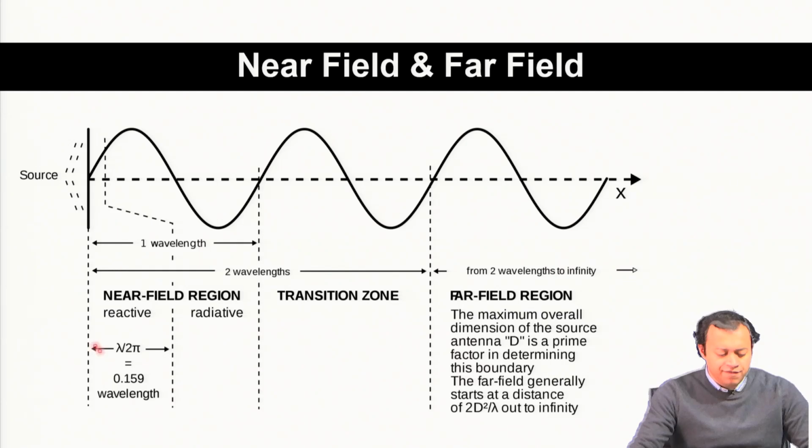One is called the near field region and one is called the far field region.